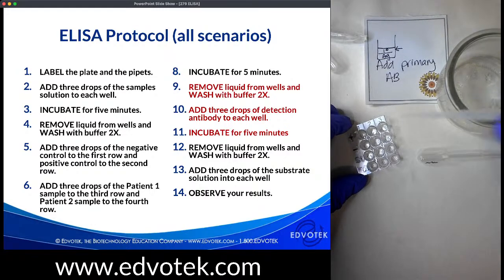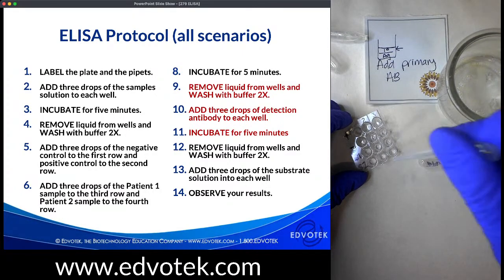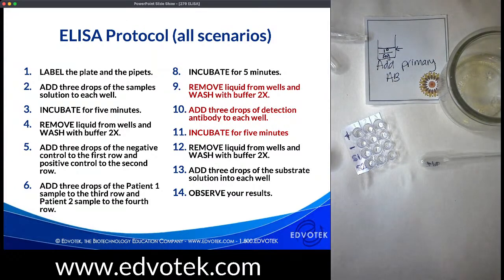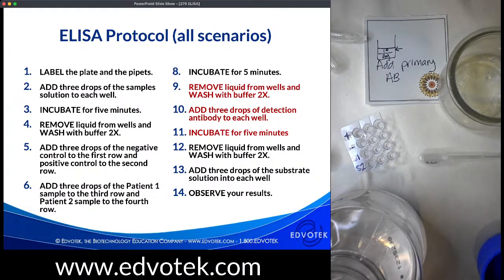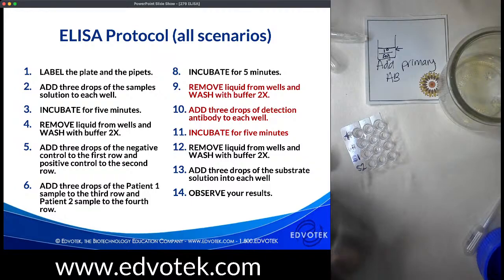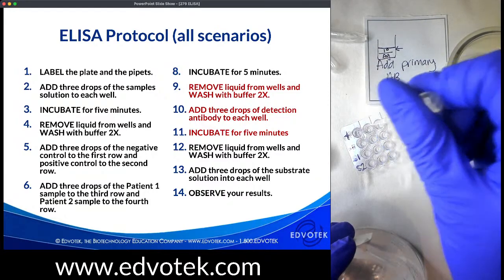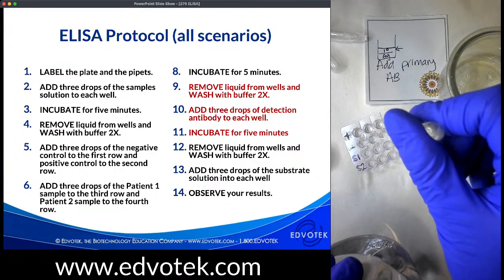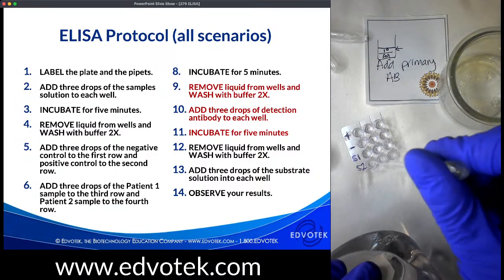Again, I always like to make sure that everyone knows that science doesn't always work the first time. That's the reason why people spend years in the lab trying to perfect techniques. But by the time you get some of these commercial ELISAs at home, they're going to work 95 to 99% of the time. And that is pretty remarkable, to be able to design an assay that works that reproducibly every time you do it at home. And that's by people who haven't trained to use it. I am a parent, I have 2 kids, and when you're taking a pregnancy test, you're really not thinking about performing it properly. And so it's just amazing that those work as well as they do, without any sort of technical expertise, considering the way that some techniques can be finicky.